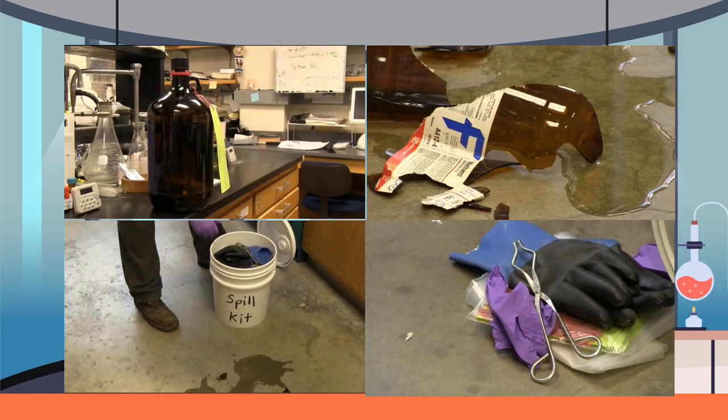If you are ever unsure, just grab a safety data sheet (SDS) to check the rules, or call the EHS team. There's no shame in asking for help. It's much better to be safe than sorry.